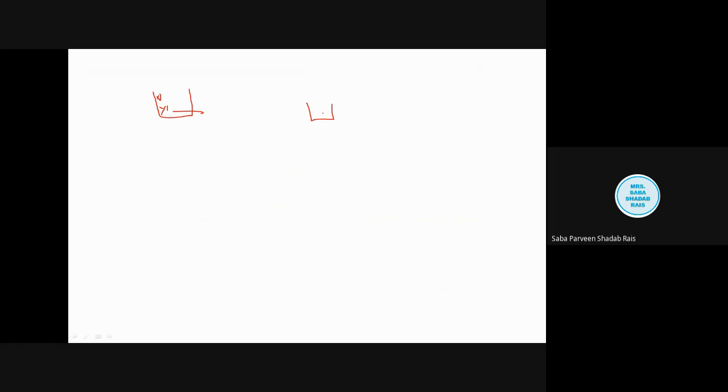I told you this ELISA plate can allow attachment of antigen as well as antibodies. So here these ELISA plates are made with a special type of antibodies. Now suppose I am interested in studying the antigen X, right? So I will have the ELISA plate which is already bound with the anti-X antibody. So here the only speciality is that those antibodies would be there.